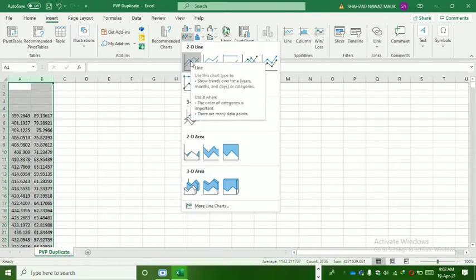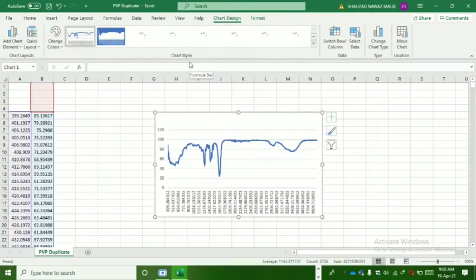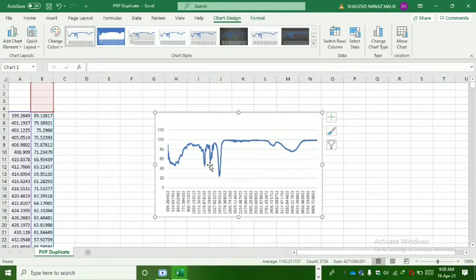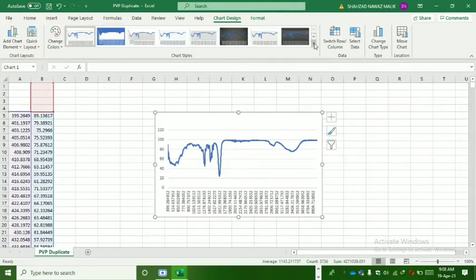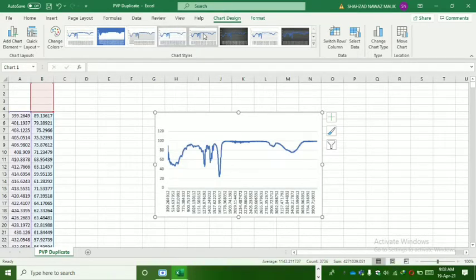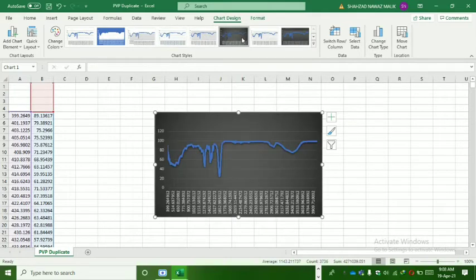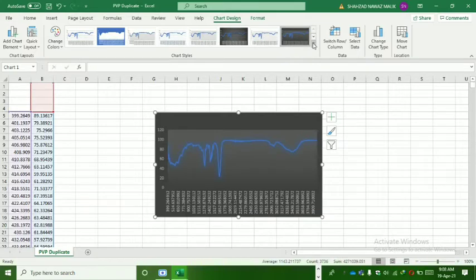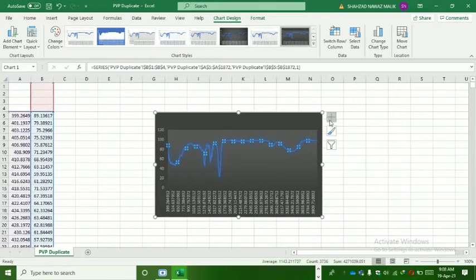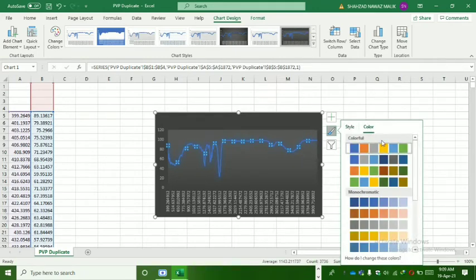It is the resultant spectrum of these numerical values. Now we can change its style. There are many options here. You can bold it, you can change the background also. And if you want to change the color of this line, you can move here and select color from here. Here I choose this color.